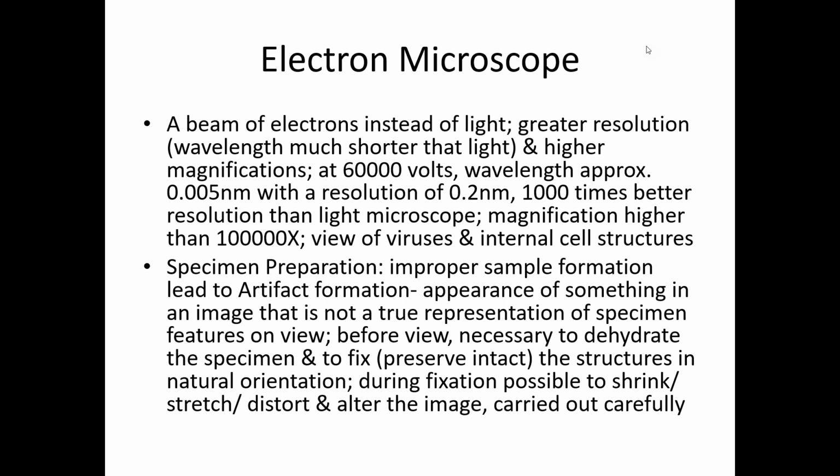About the resolution of a light microscope, it was around 200 nanometers, whereas in electron microscope it will be quite higher. So now we are moving on to electron microscope, right? So those who know the basics of light microscope and microscopy, electron microscope will be very easy for you. But those who don't have any idea about the terms of microscope and microscopy as well, it will be a bit difficult, but I will try my level best to make it simple as possible.